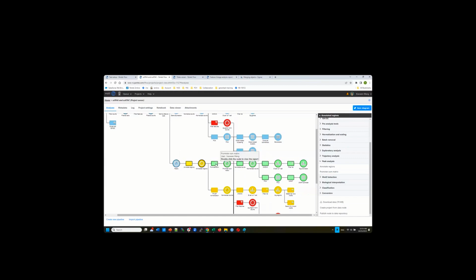You sum up all the reads in the promoter region for every gene. So the result will be a number similar to the gene number. Before we had 82,000 features; once you generate this matrix, it is 14,000 features.